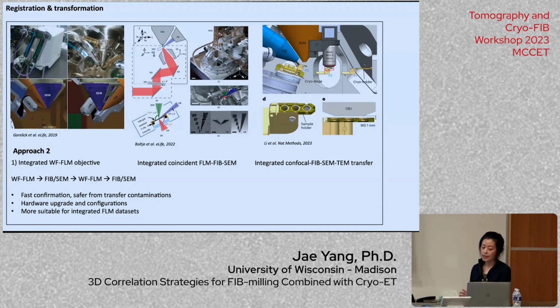And then there is the confocal, because people want to get better and better resolution. And then they also want to directly transfer into the TEM, so make this process as smooth as possible. So it is very fast confirmation, but it does require hardware upgrade and configuration, and it's more suitable for integrated FLM data sets.